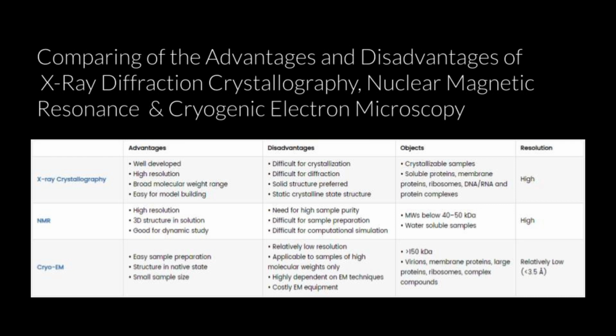But there is no all-purpose method. All three of them offer their own advantages and disadvantages. I touched on cryo-EM's advantages already, but when directly comparing it to these other methods, it has an easier sample preparation, less sample needs to be used, and it can remain in its native state.